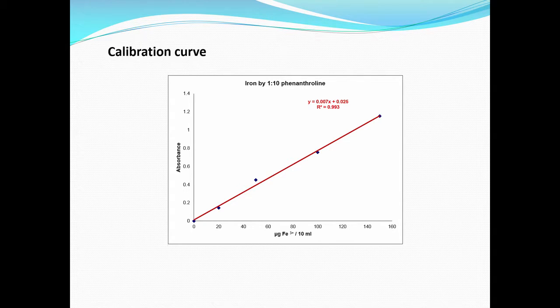So, I have a limit of nickel toleration: up to 100 micrograms of nickel can be tolerated in the method, and cadmium can also be tolerated up to 50 micrograms, in the presence of 1 ml of citric acid citrate buffer.